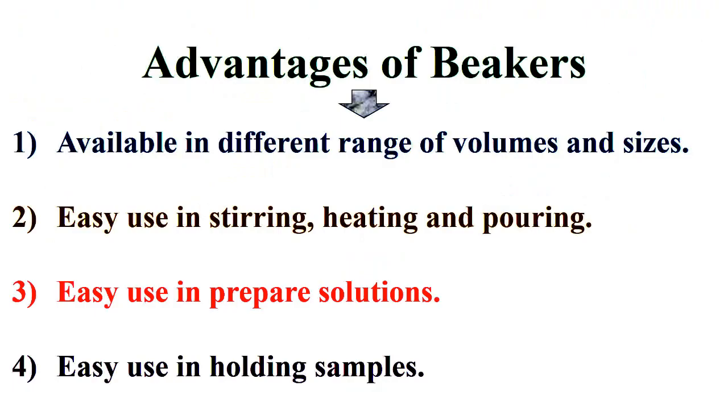Beakers are available in different volumes and sizes, and are easy to use in stirring, heating, and pouring, preparing solutions, and holding samples.